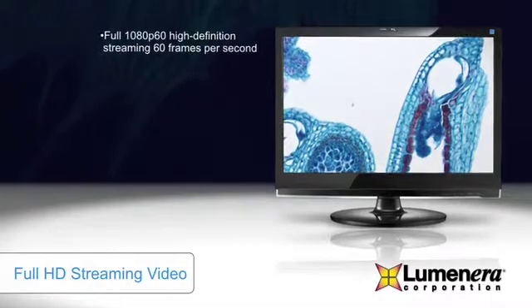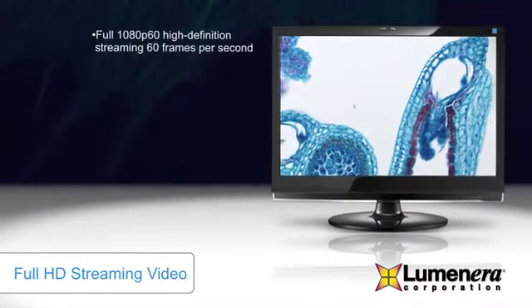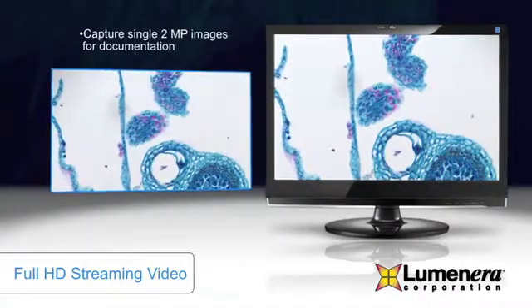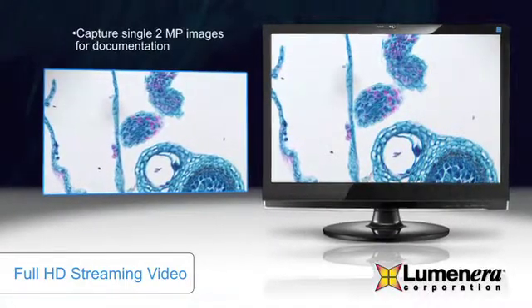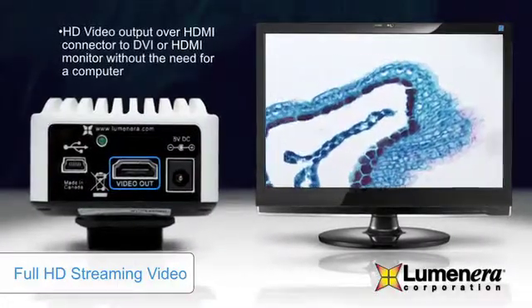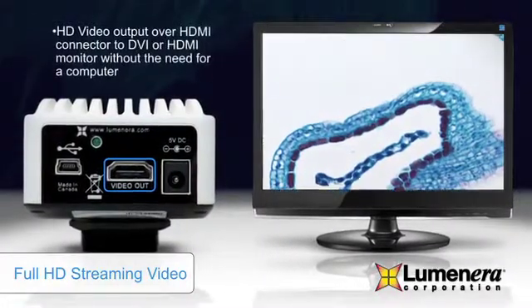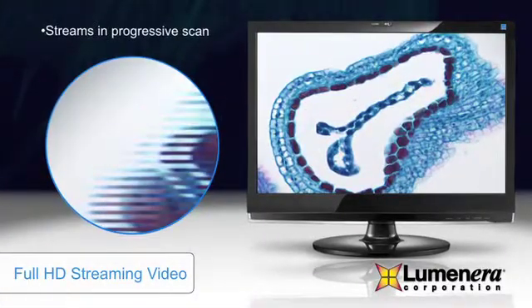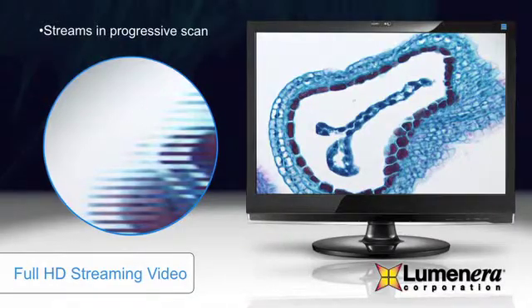This allows for smooth sample manipulation on the preview. It also offers the ability to capture two megapixel images via USB 2.0. You can stream video over an HDMI connector directly to a monitor without the need for a computer, and because it streams in progressive scan, there is no distortion or jaggedness that comes with interlaced images.